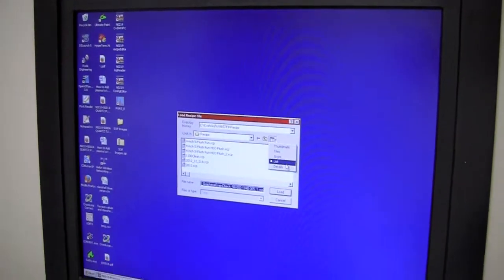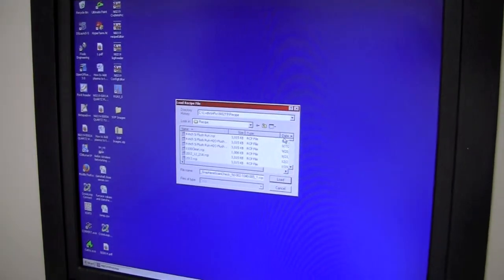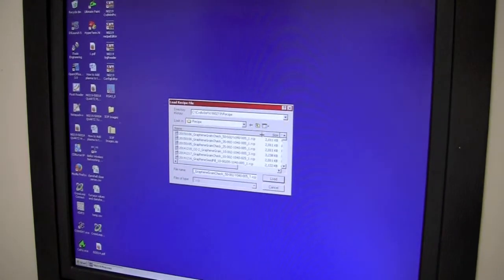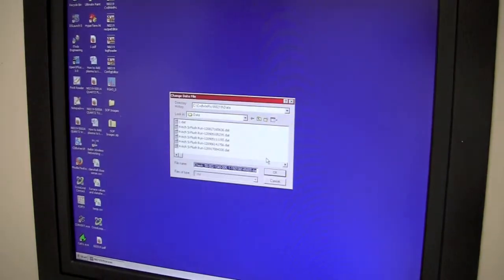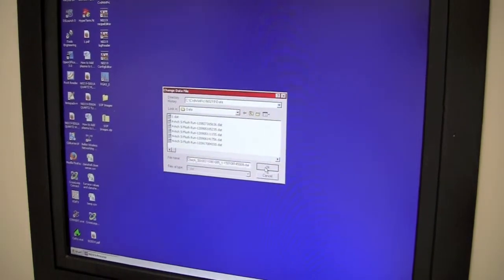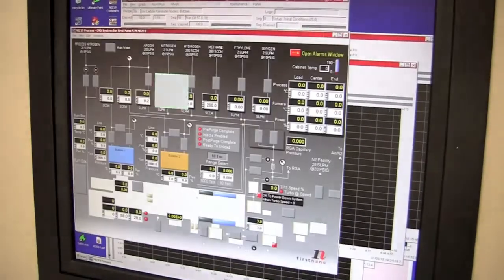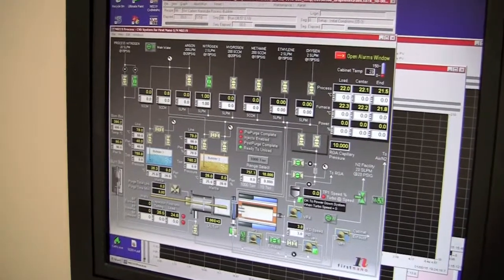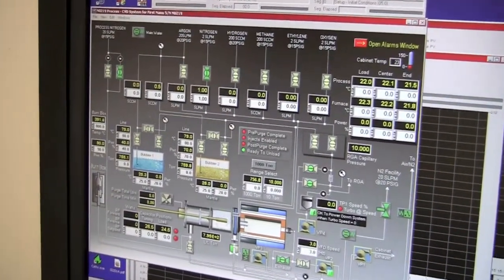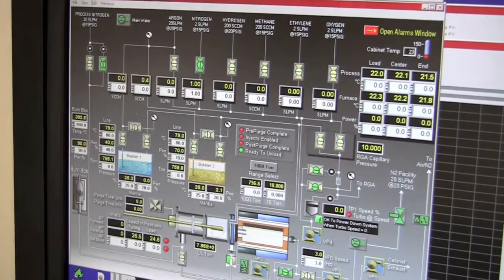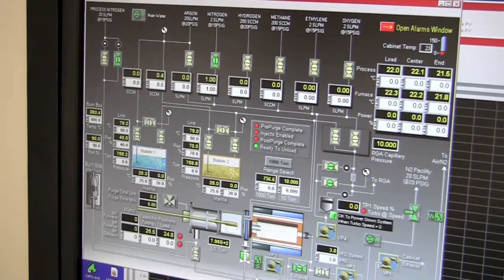We begin by opening up the CVD Win PRC program. From here, we're going to select our desired growth recipe. Today, I'm going to pick a graphene growth recipe. Then we'll click OK to save our data logs. Once we do that, the graphical user interface will open up, allowing us to monitor the temperature, flow rates, and pressure of the CVD furnace in real time.